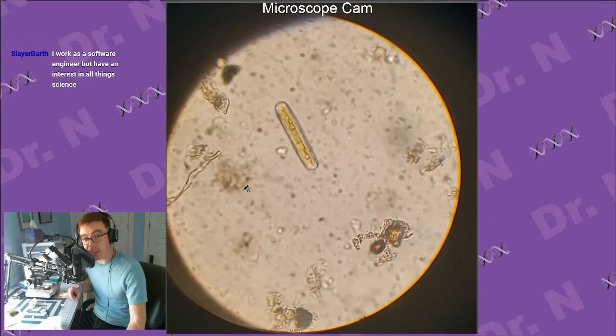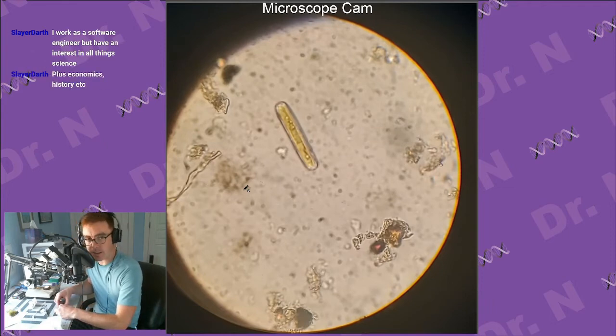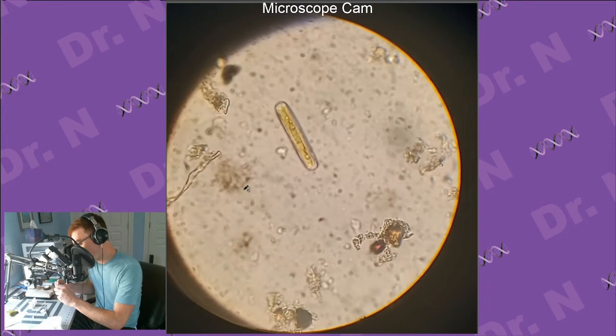You did kind of catch the very end of today's general stream, but we've been playing around with my microscope, trying to find something interesting to look at, basically with dirt and moss that I found in my backyard. Next time, I'll get some liquid from the gross pond that's just down the street. But right now I'm preparing a slide of my own cheek cells, which will hopefully be a little bit more interesting because you can really tell what the cell looks like.